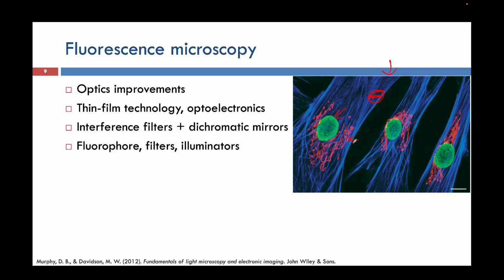And generally fluorescence microscopy is not used if we want to see normal optics. In simple terms, it is used for a specific purpose.